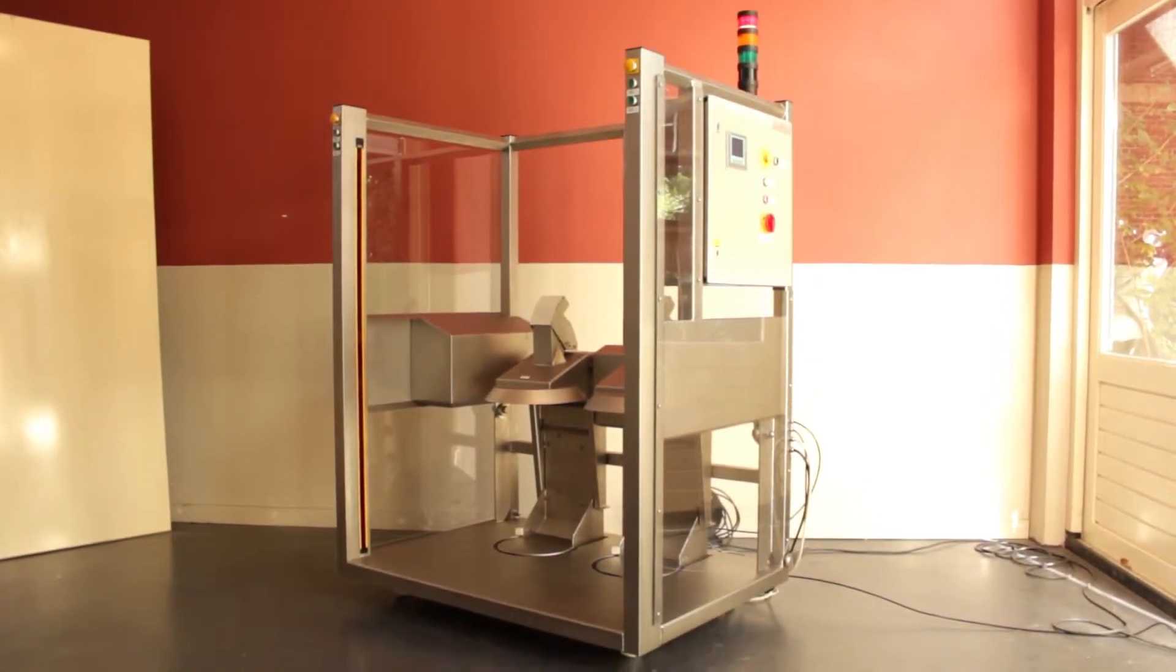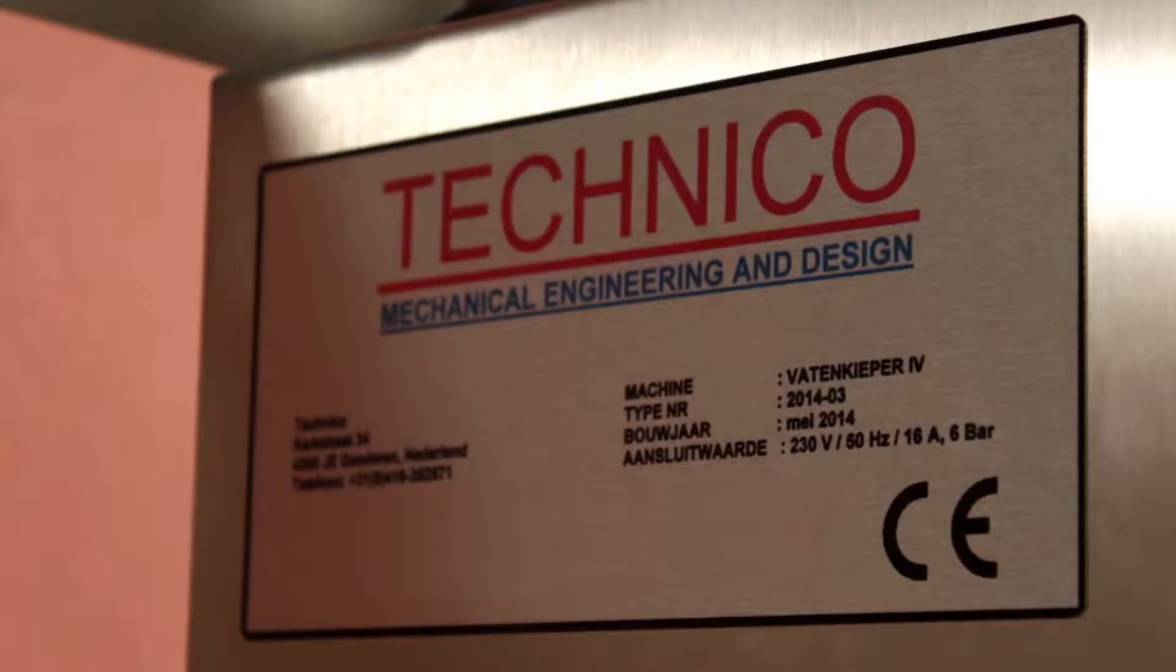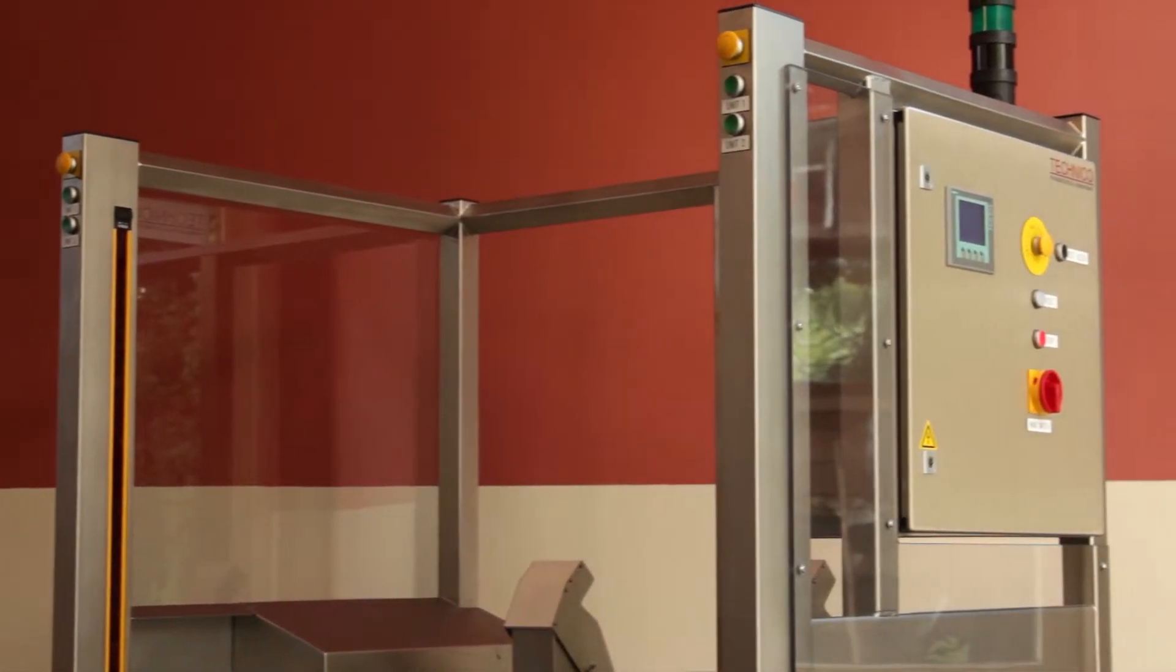The drum tipper, developed by Technico Pharma, is used to empty drums with pharmaceutical tablets in a fixed hopper in an ergonomic way.